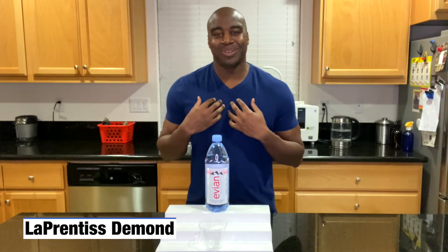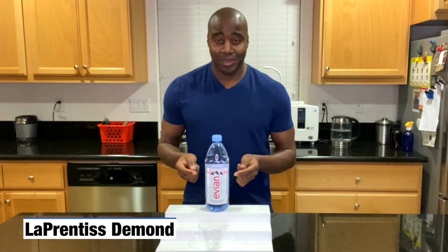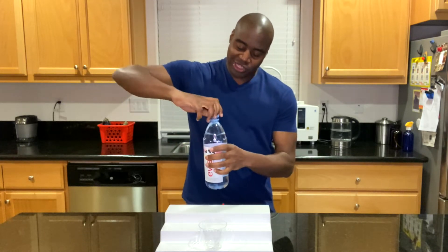Hey, what is going on? LaPrentice Daman here, and today I am doing a pH test on Evian's French Alps water. Let's go ahead and get this opened up.